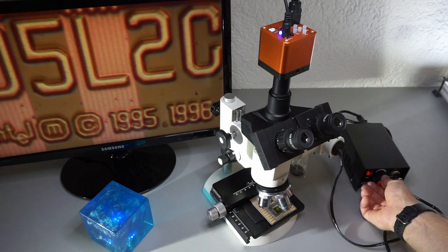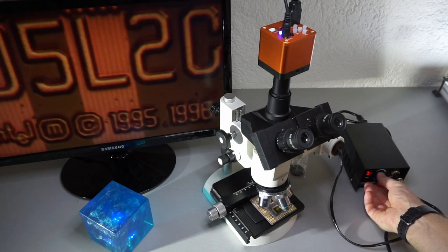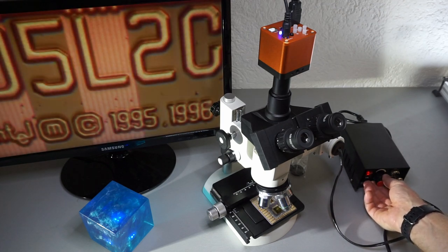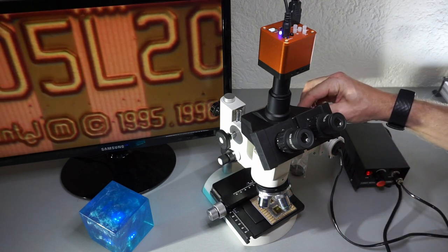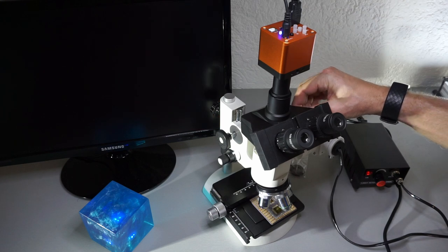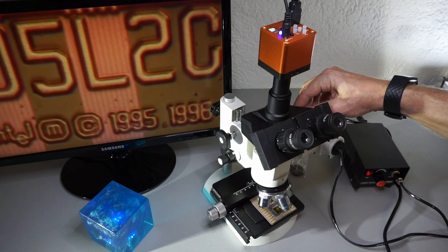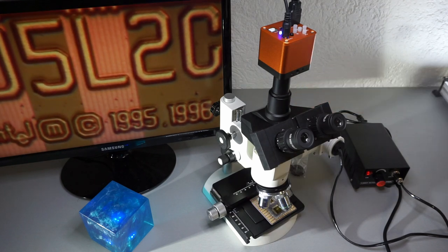I can now play with the light source. I can do it a bit brighter, I can dim it. I can change to a system where I'm looking through the oculars at the same time and use the camera. Wow, look at this magnification. And I'm only using the 4x magnification and the camera.